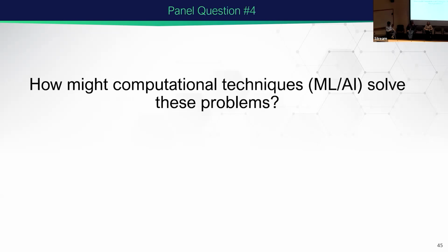Yeah, I think one of my main focuses is looking at multiple images and putting them through advanced AI and machine learning approaches so that the algorithm can tell me what's either co-localized or anti-localized, and get that biological information that way. Right now, Kevin and Dušan can spend hours. There are tools to help, but there is a lot of manual processing, and the human eye is great at recognizing patterns, but AI is better.